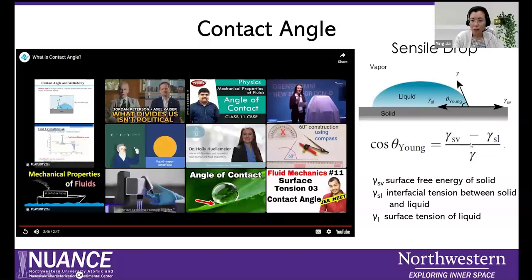This is a very basic contact angle, and we usually refer to it as the static contact angle, because we just drop water on the surface, and while it's in a static mode, you just measure the shape and use the fitting of the shape to get this angle from these curved lines. So let's go to the next one.